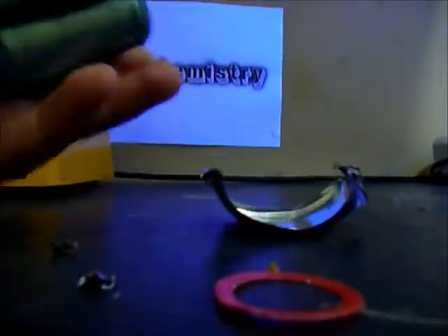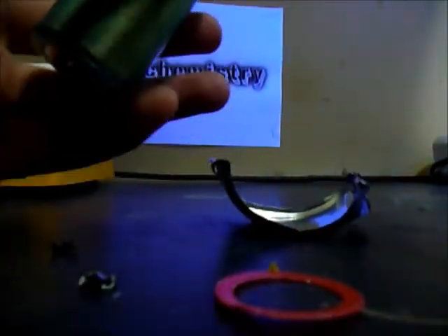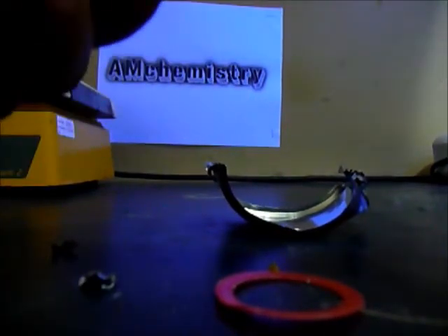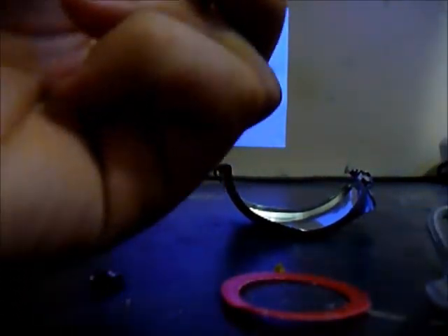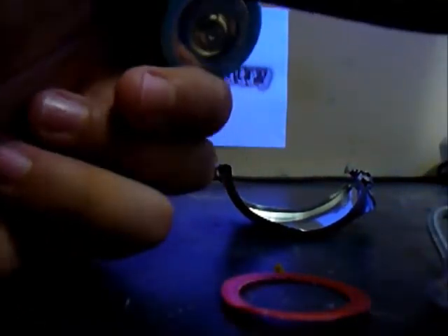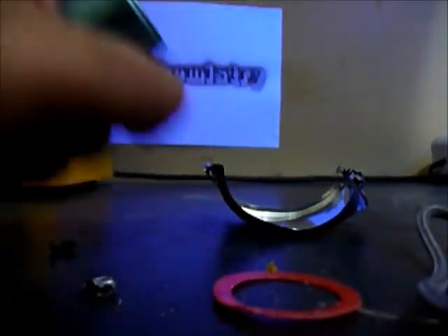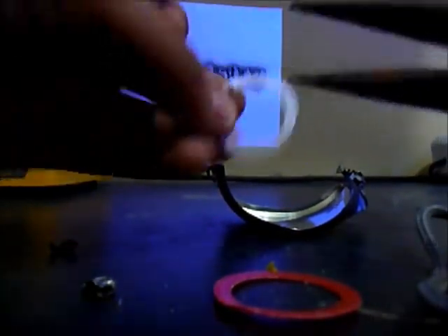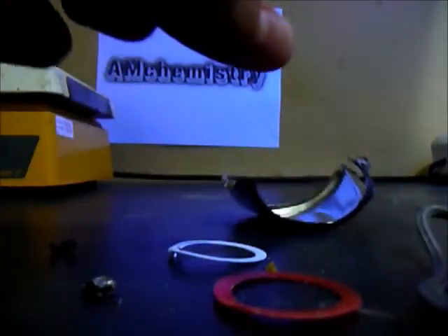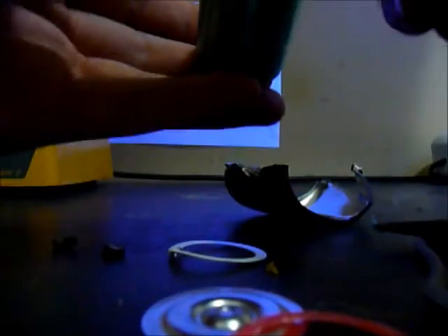After taking the metal part off, okay it already came off, just take this off with some pliers. That's what I'd be doing, it's pretty hard. Okay, we'll just first take off the plastic. So with the pliers, take the hard plastic off. And the liner came off of the plastic, okay, you can see it's coming off.